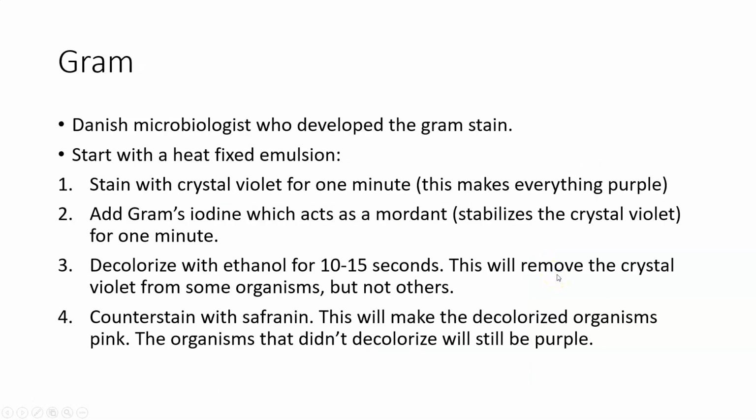One of the procedures that you're going to spend a lot of time doing in lab is the gram stain. It's very regimented again in how you have to do it. There are 4 steps. They all have specific times that you have to carry out. If you don't do them long enough, you're not going to stain things correctly. And if you do them too long, you're going to get false results as well. And so this is one of those things you're going to practice time and time again when you're in the lab until you get it right.